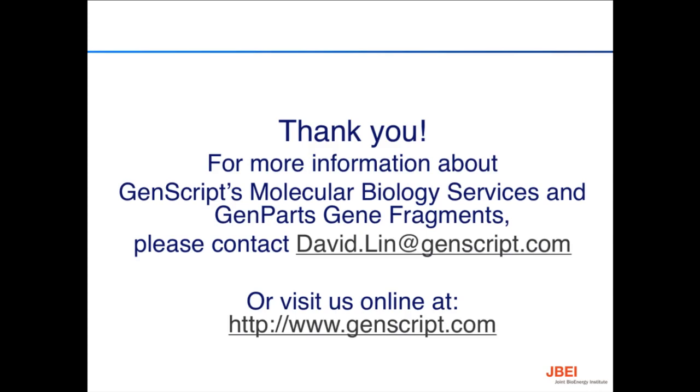Okay, and then she also wanted to know, commercial vector backbone sequences presumably can be uploaded into the system. What about if you have plasmids or constructs that you've designed yourself? Could those be uploaded into the Teslagen? Yeah, exactly. That's what I did in the demo that I showed, I had just uploaded all of those plasmid templates. So you can upload anything that you have yourself, and you might be able to access some really nice commercially available vectors too. That's great.